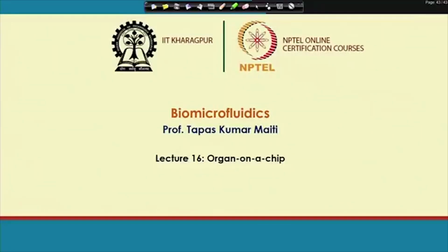So, now we are coming to how this microfluidic system could be used for application aspects, like say biochemical analysis, say organ on chip. So, in this lecture I shall go through how organ on chip is developed on the basis of cell culture principles in microfluidics and, to some extent, tissue engineering aspects, to develop that miniature form of the organ on chip. So, what do you mean by the organ on chip?